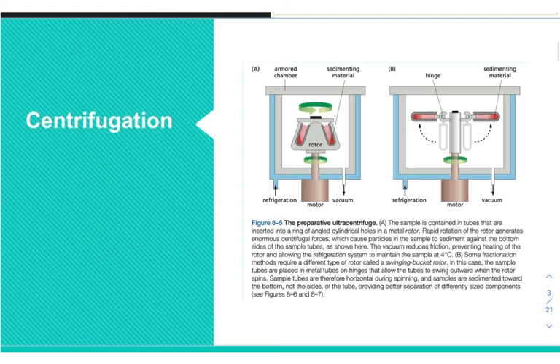So now we're going to turn our focus to centrifugation. This is another important technique in biological labs. Basically, the way that this works is you'll have tubes that balance each other out in a spinning apparatus called a centrifuge, and there's going to be a force from the circular motion that basically forces everything down in the tube. You can have something called a density gradient, and we use this to measure various things, to filter things.